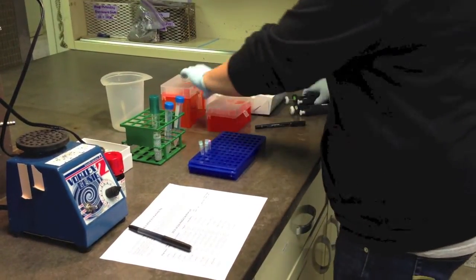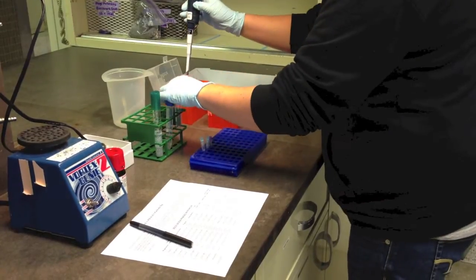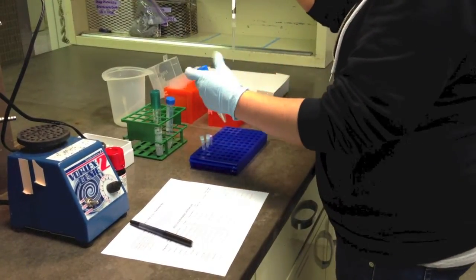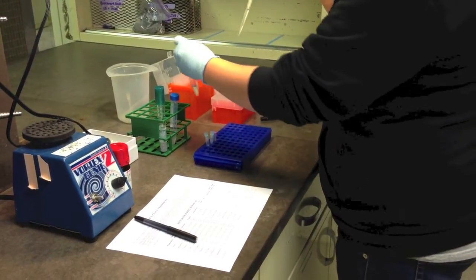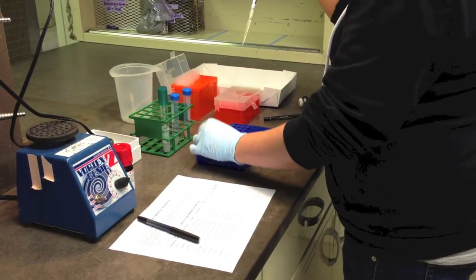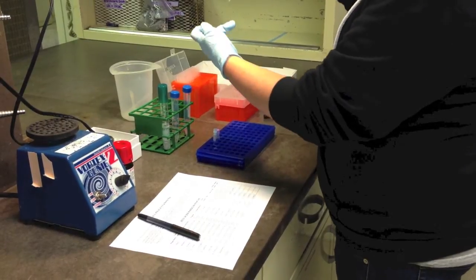Once you have prepared the phage-lysate mixture with DMSO, you may then proceed to fill up your archived tubes with sample. At this point, I would like to take a break to explain both proper and improper procedures for loading the beads.